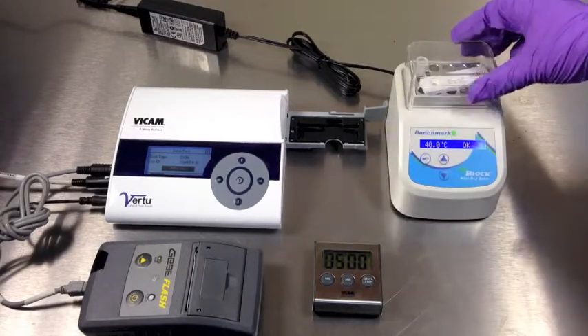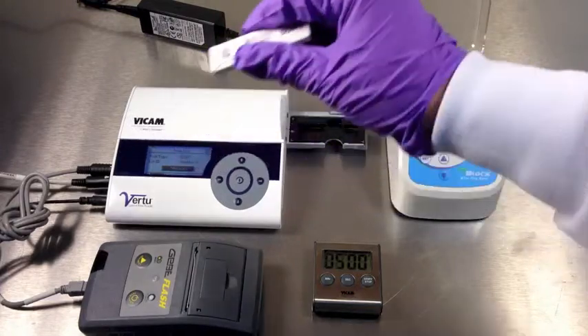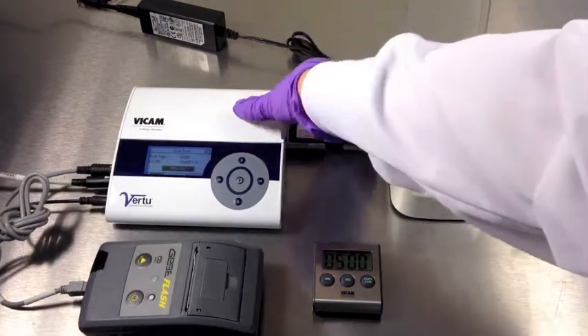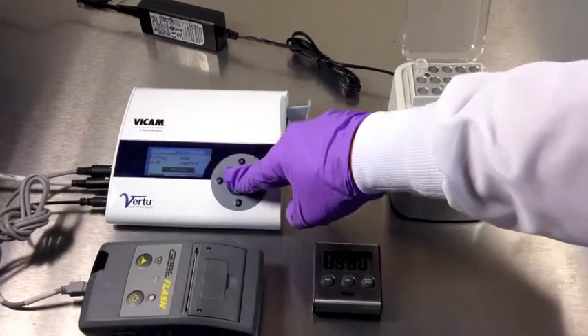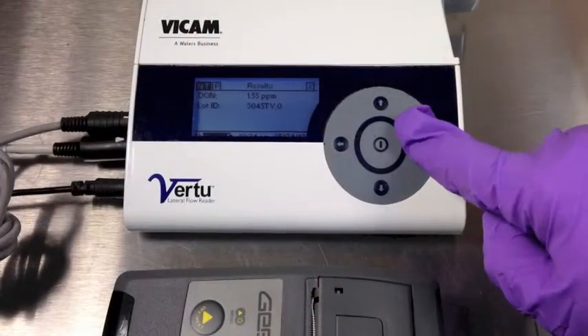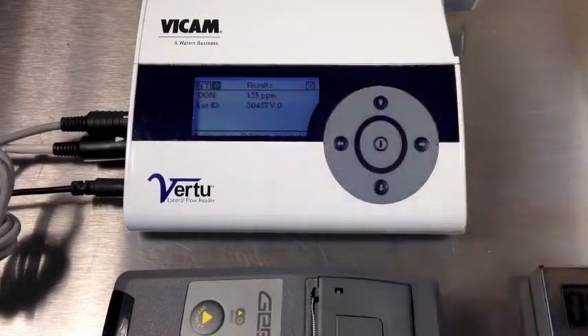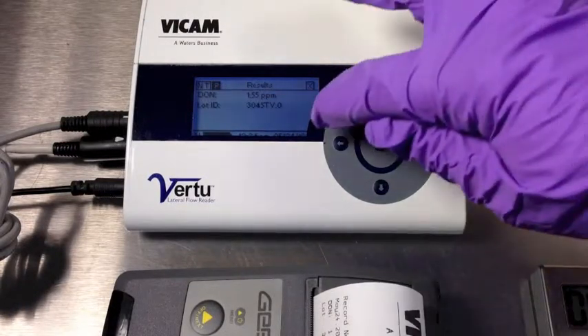Insert the Don V strip test into the Veritu reader with the circular opening to the left. Press the center enter button to start the measurement. To print the result, use the right arrow key to select P in the upper left corner of the display, then press the center enter button to print.